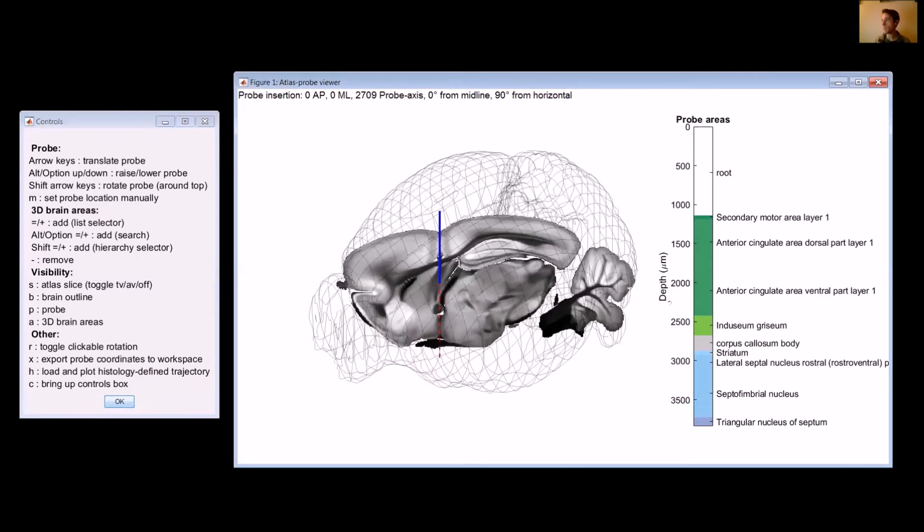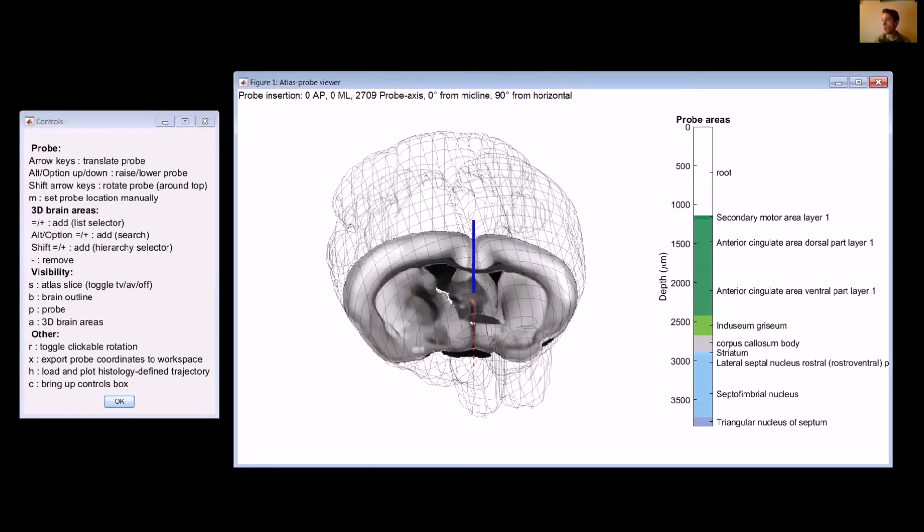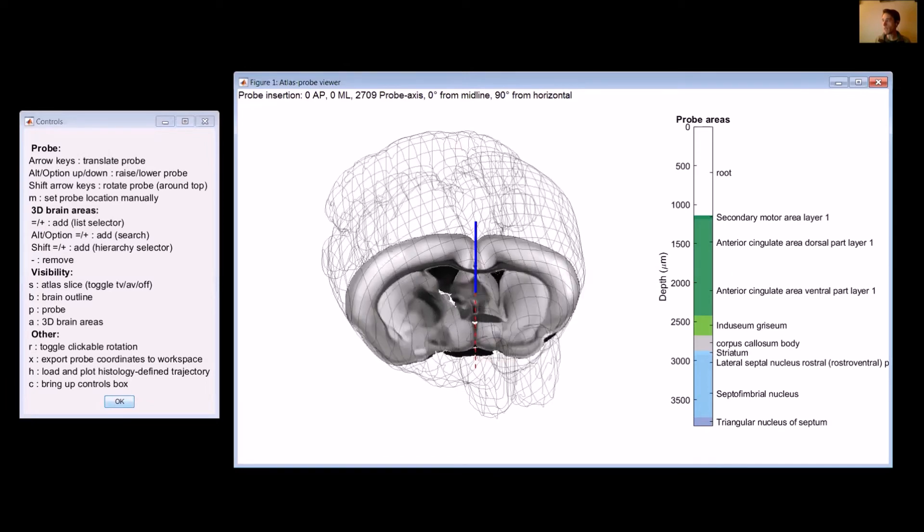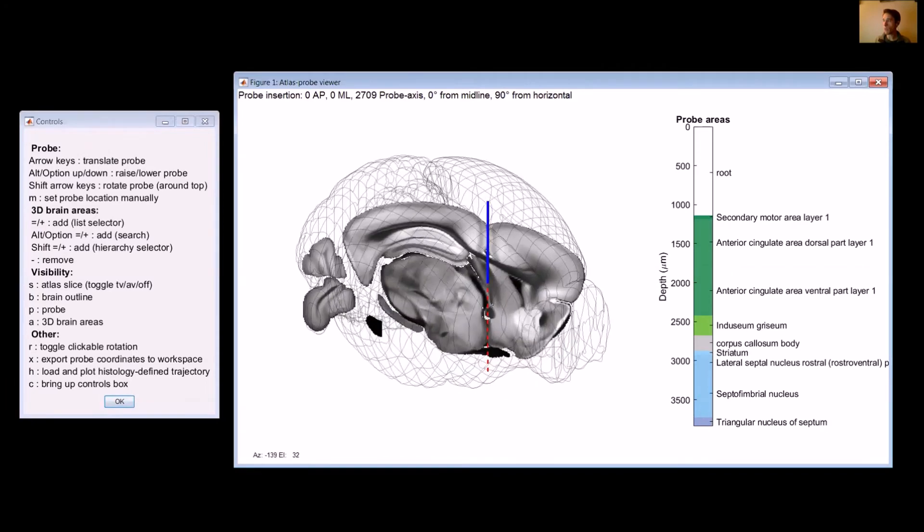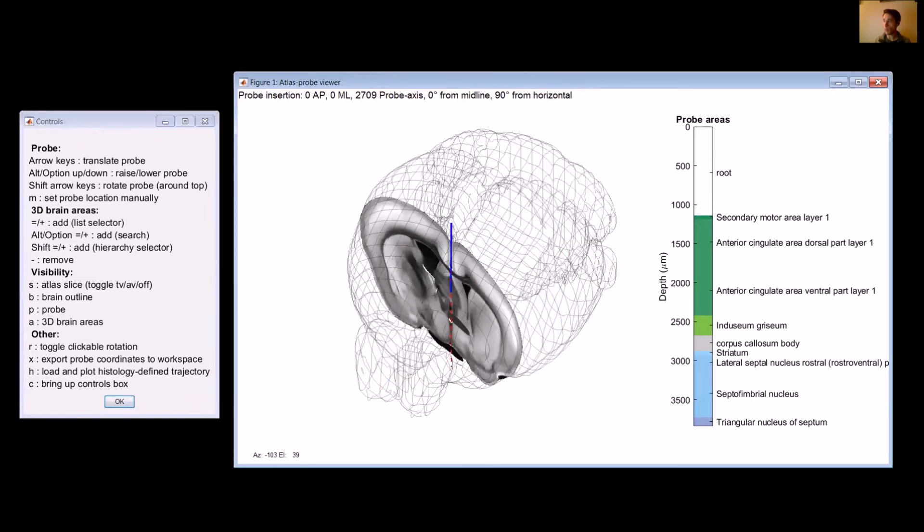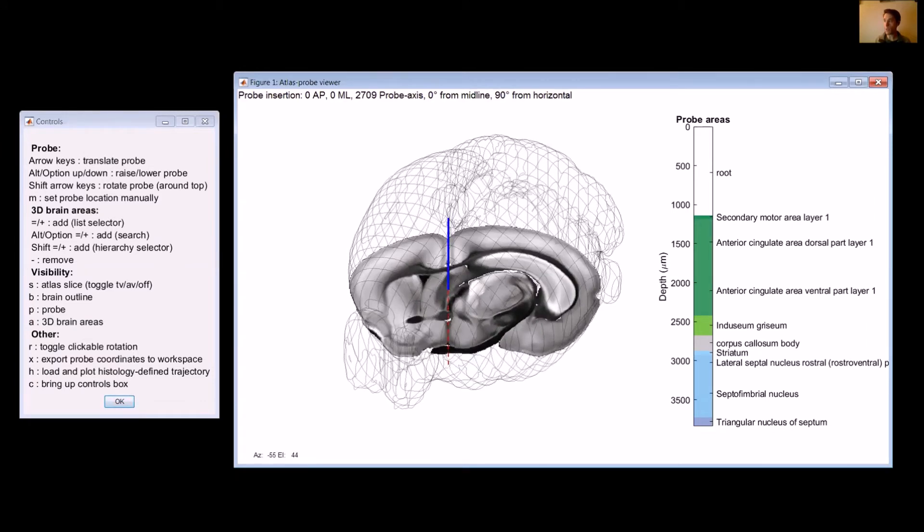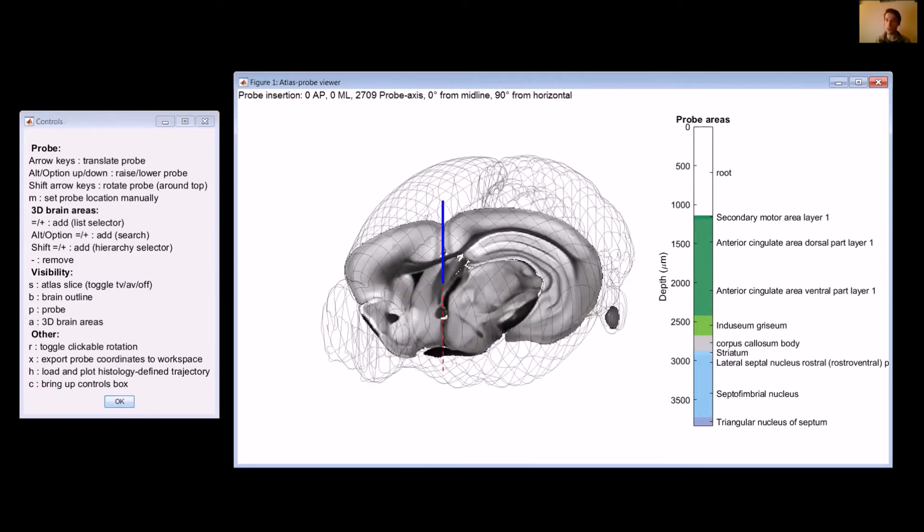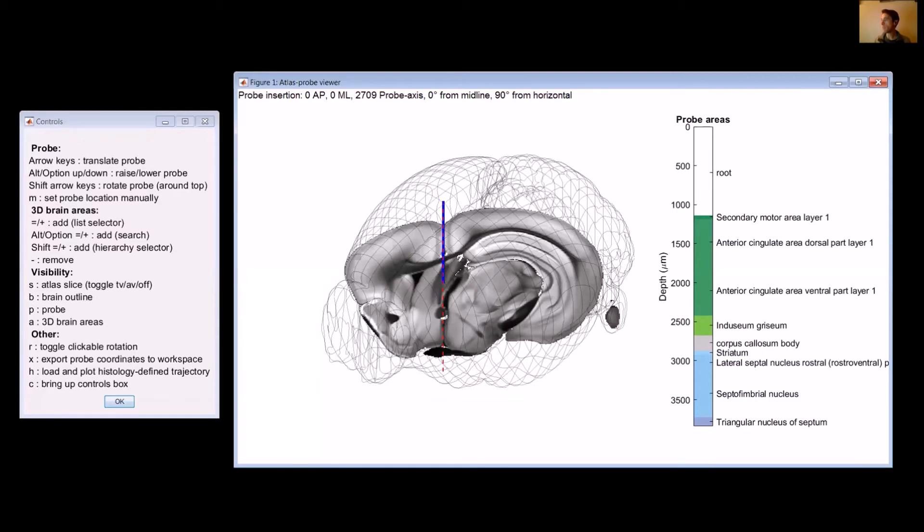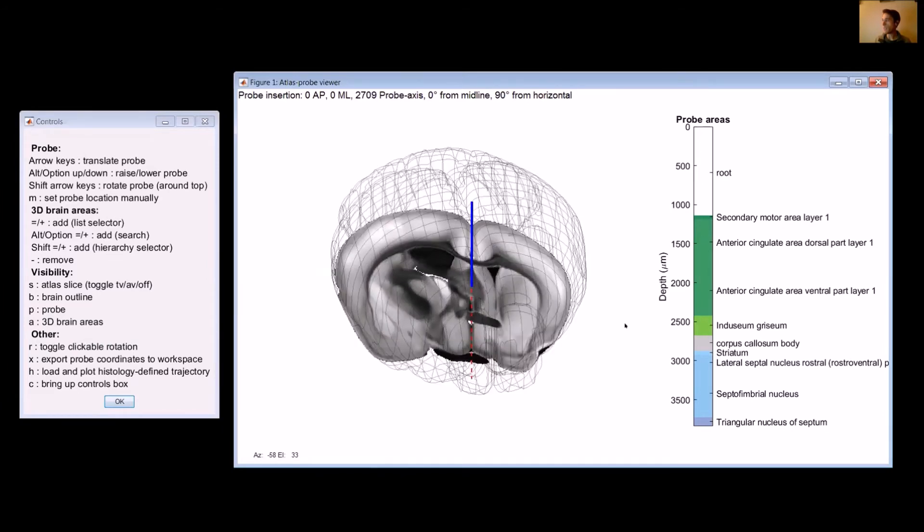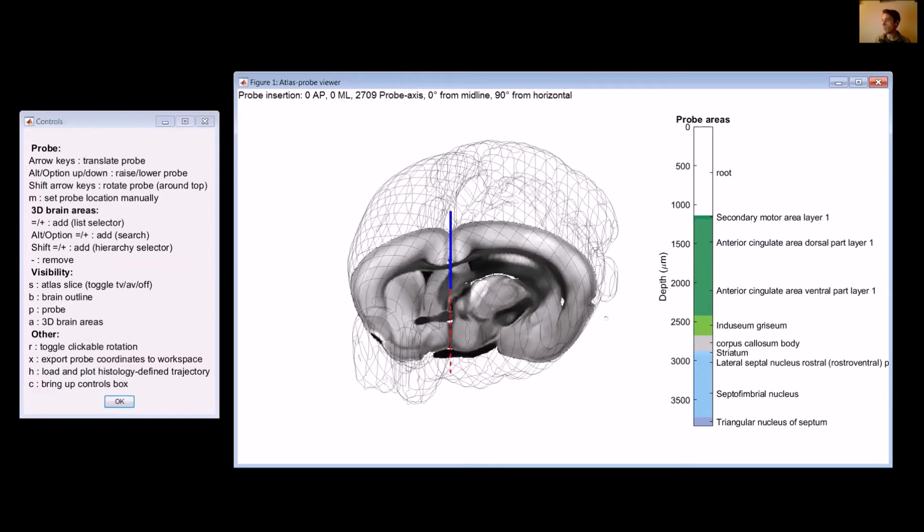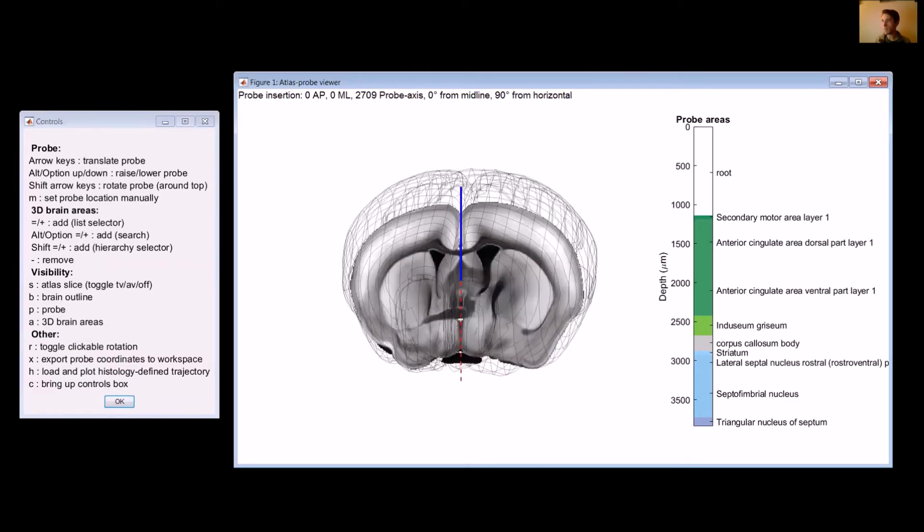At the moment, what we're looking at is a 3D rendering of the brain. We've got this wire frame showing the outline of the whole thing, and then we've got this slice. The slice is going through the trajectory that you picked for your Neuropixels probe. And the Neuropixels probe trajectory is shown here. The red is the whole trajectory, where you could possibly go with the probe, and the blue is the approximate length of the probe. So this is like your actual probe, the blue, and the red is where you could put your probe along that line. At the moment, just in the default, it puts it right in the center, and it's showing you that you're going through these areas. So starting out in cortex here, and then as you go a little bit lower, you're getting into the septum and some other things.